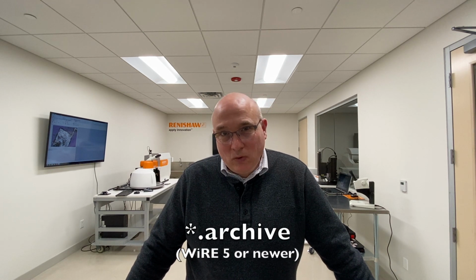Four, the final item that you might need is the configuration file for your instrument. This is either an RRG or an archive file that is either stored on your desktop or on the Raman system backup CD. It's not necessary to have this, but it could make it a little bit easier to install the software as it copies a lot of the configuration of your instrument directly to the new install. So if you have access to the PC, let's grab those as well. So, with all that said, let's get started by showing where to download WiRE.